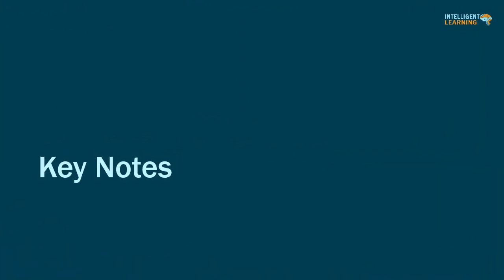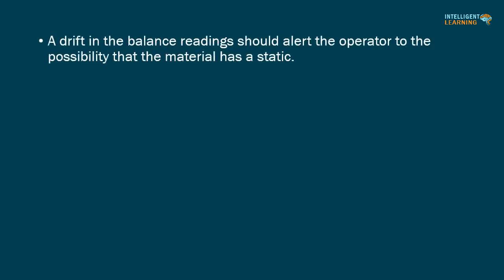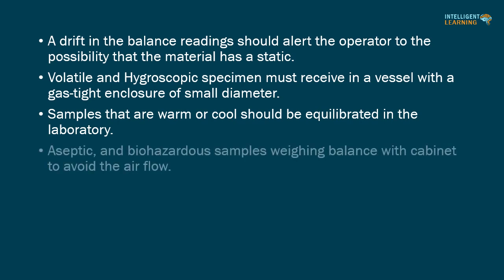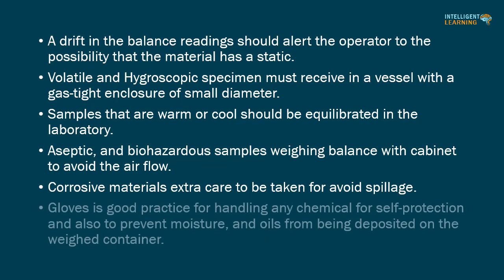Key notes of this video: A drift in the balance readings should alert the operator to the possibility that the material has a static charge. Volatile and hygroscopic specimens must be received in a vessel with a gas-tight enclosure of small diameter. Samples that are warm or cool should be equilibrated in the laboratory. Aseptic and biohazardous sample weighing should use a cabinet to avoid air flow issues. Corrosive materials require extra care to avoid spillage. Gloves are good practice for handling any chemical, for self-protection and to prevent moisture and oils from being deposited on the weighed container.